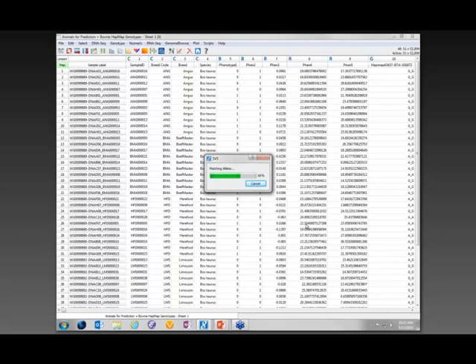And this matching alleles portion just takes a second. It's making sure that there aren't any that need to have their strands flipped. And after it's done with this, applying the model happens in the blink of an eye. And as you can see, it's already creating the results.